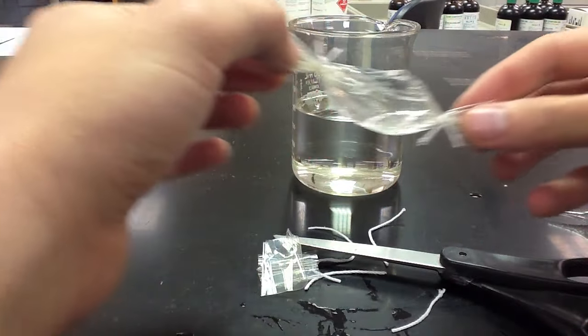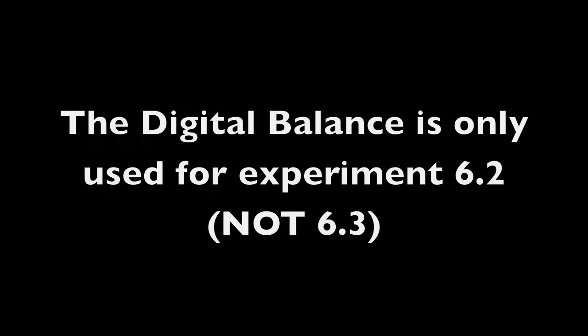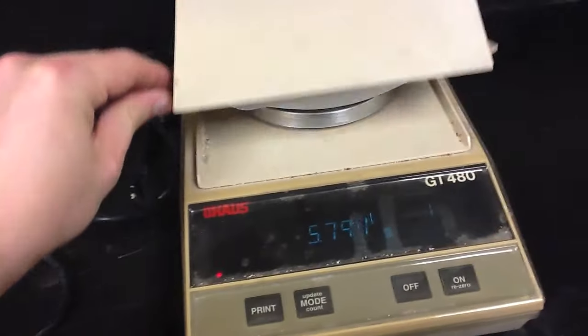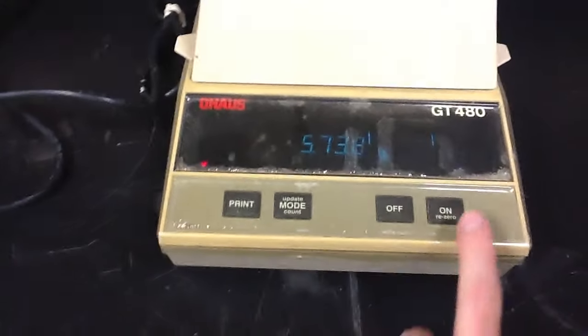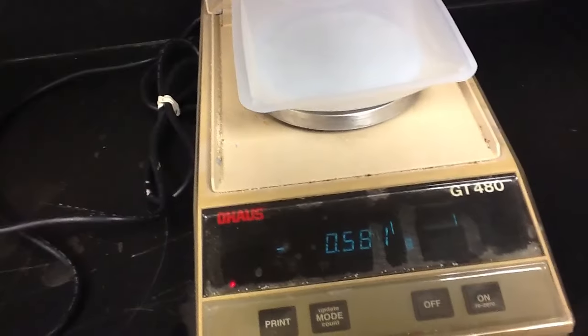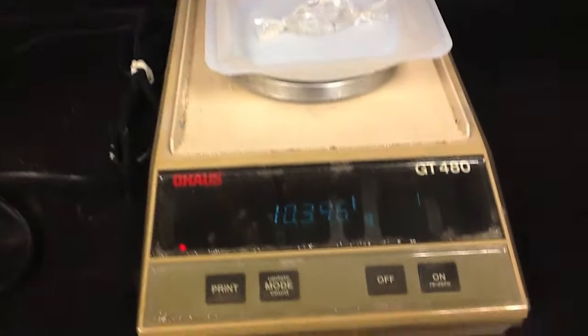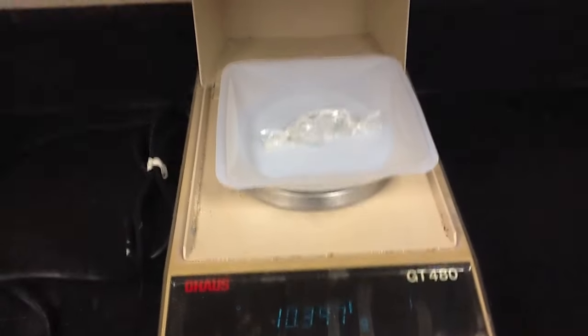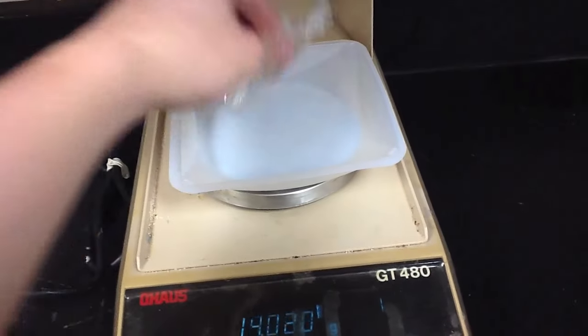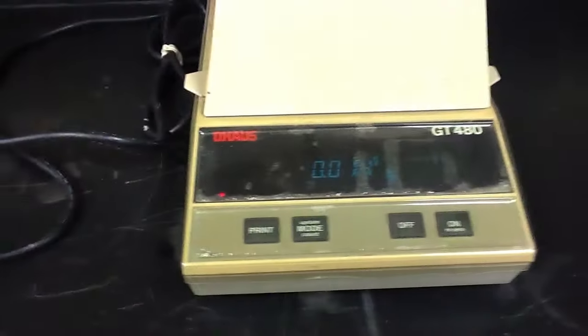Once we've done this, we're ready to take our bag and obtain its initial mass. If this is the exercise described wherein we placed sucrose or water into the bag, we're going to need to first obtain its mass using the digital balance. So here I've tared out the digital balance, the large weighboat on it, and I now place the bag and obtain the initial mass for that bag. At the very end of the exercise, you'll also obtain a final mass for the bag.